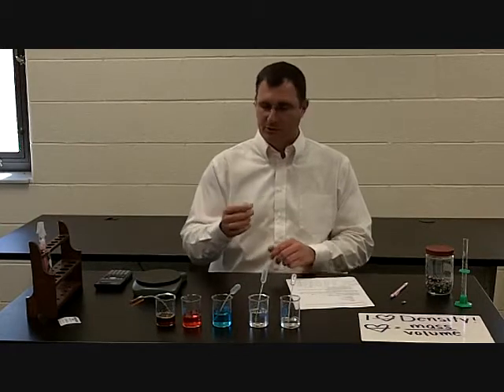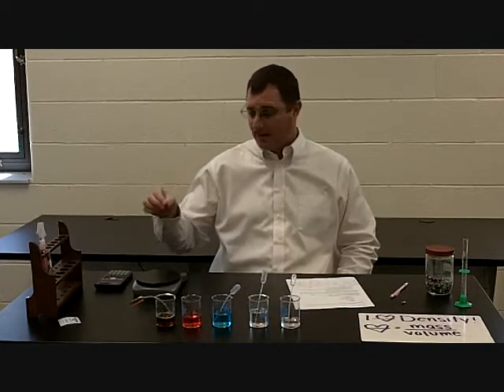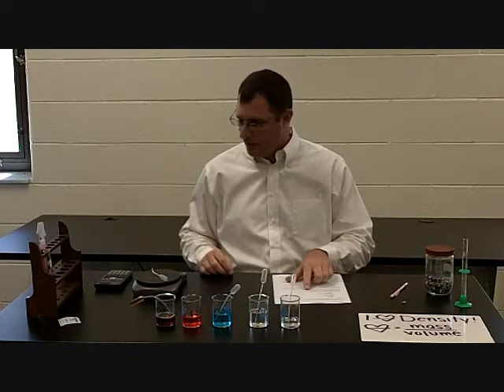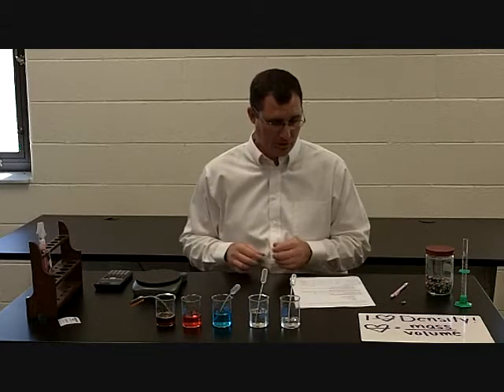The first thing you're going to do is take a pipette and find the mass of the pipette. And the pipette weighs 0.9 grams. You're going to put that on your sheet.